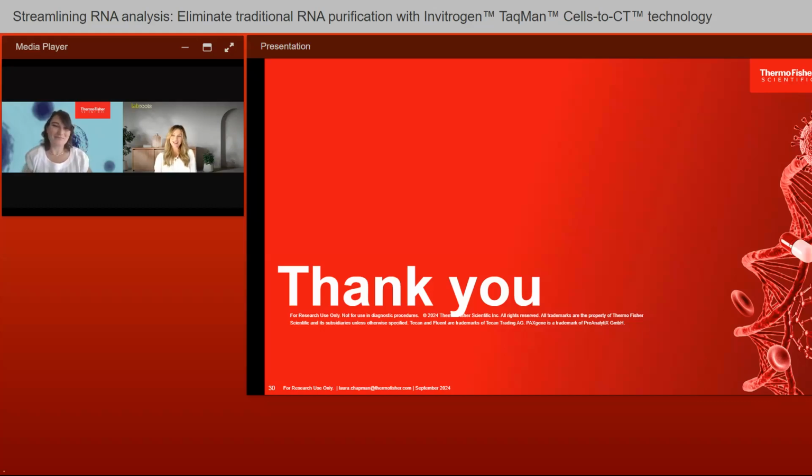Very good. Thank you, Laura. And it looks like we have time for just a few more questions here. What is the typical or average turnaround time for completing a screening assay when using cells-to-Ct?